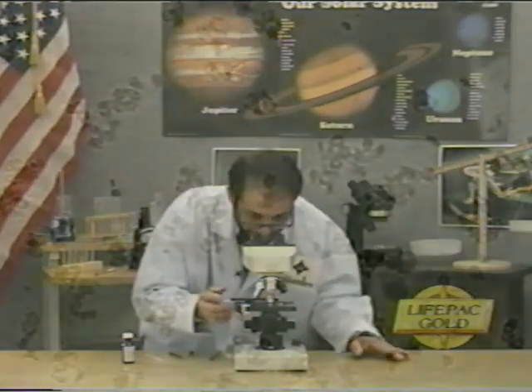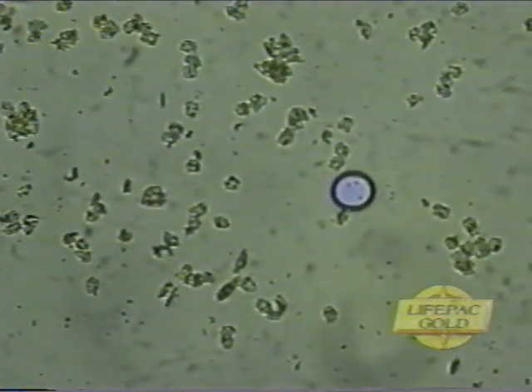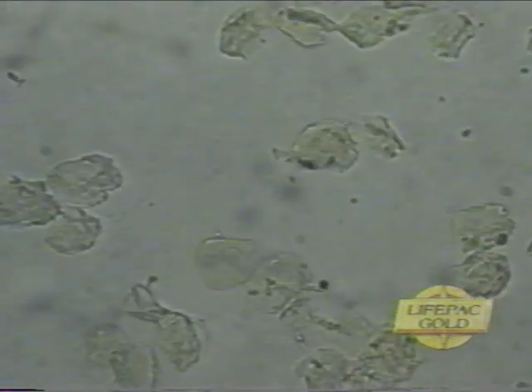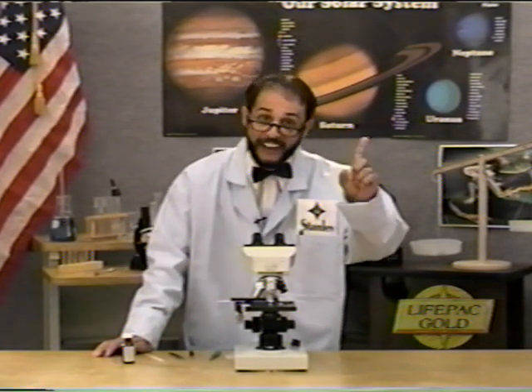and have a look. See, there's a cell, and there's a cell. Look at all those cells, thousands of them, from one little piece of skin. Think of how many cells there must be in all the skin on my body. And those are just skin cells. There are all kinds of different cells. It makes sense. A cell is the unit of life.